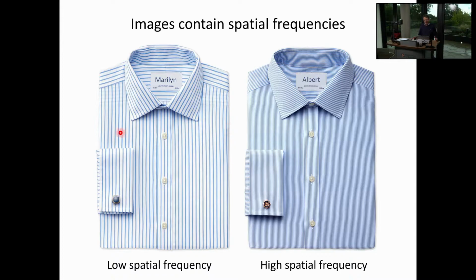So along X, the spatial frequency is perhaps 2 per centimeter, 2 inverse centimeters. So you have 2 lines per every centimeter, because every 5 millimeters you have a blue line coming down here. So in this direction, the intensity varies by about 2 per centimeter.